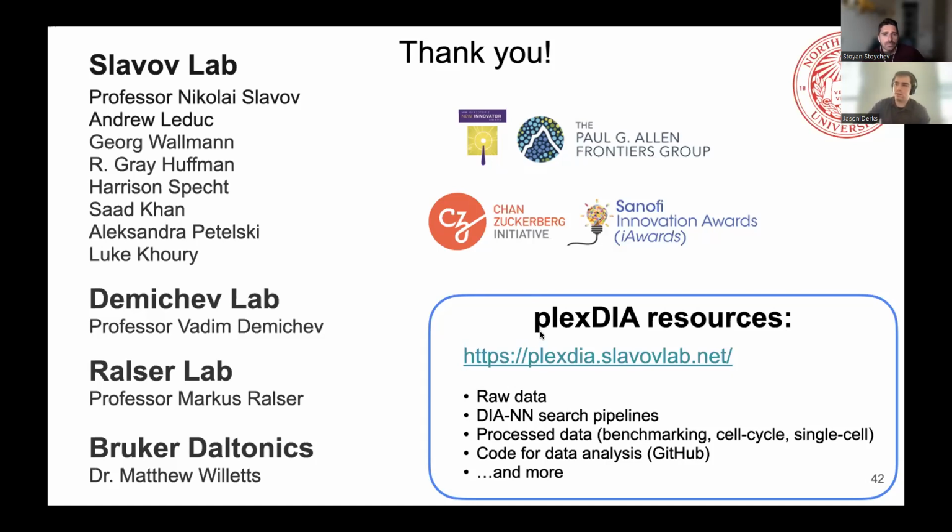Yeah, and this kind of has to do with looking at the quantitation that you would get with label-free DIA and plexDIA, and matching up that quantitation, showing that there is good agreement between both these methods. But I suppose you're talking about the outlier set. So usually if you are integrating signal, and say that you extract signal that doesn't actually exist, most of the time you're going to get a 0 value. If you don't get a 0 value, usually the intensity is going to be so low that it might as well be a 0 value.